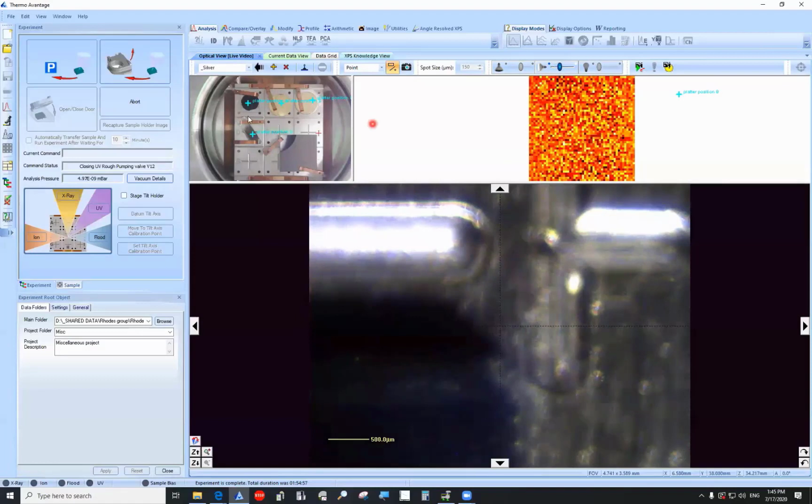So this is your platter view. This is your optical view. And the 2 sources of illumination inside the chamber are coaxial light and side light, with slider bars to adjust the illumination as you see fit. This little one right here only turns the bench lights on just above the load lock port. So it's just for making sure you have enough light whenever you're loading something into the load lock. I'm going to turn this off.